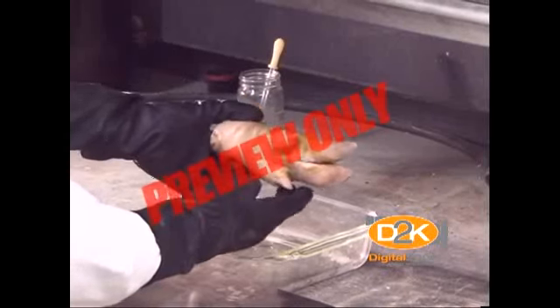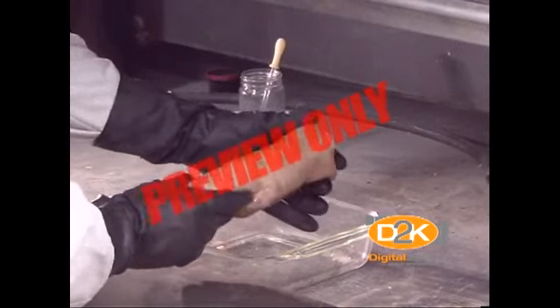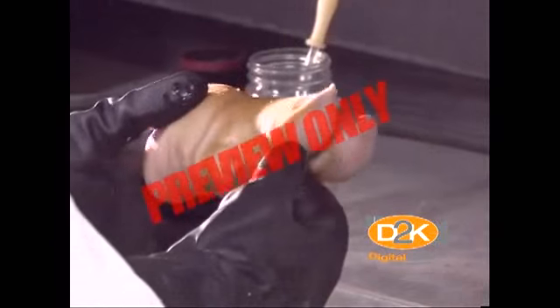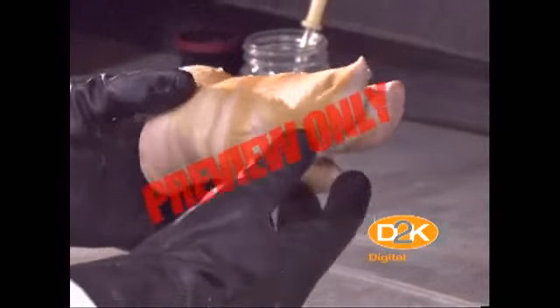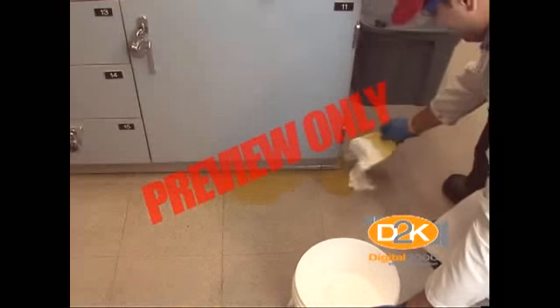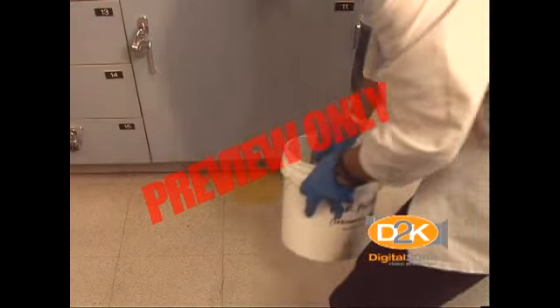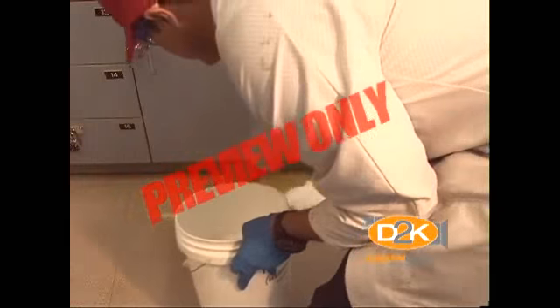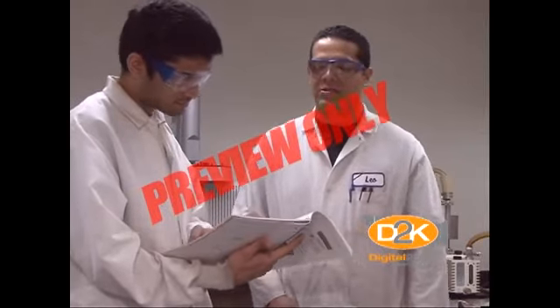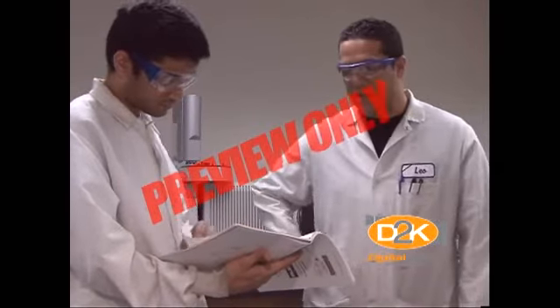In addition, animal carcasses, body parts, bedding, and all other waste likely to have been contaminated as a result of animals being intentionally infected with agents likely to be pathogenic to healthy humans are regulated medical waste. Any contaminated soil, water, or other debris resulting from the cleanup of a spill of any regulated medical waste is regulated. In this program, we have covered major components of a biological safety plan specifically for universities.